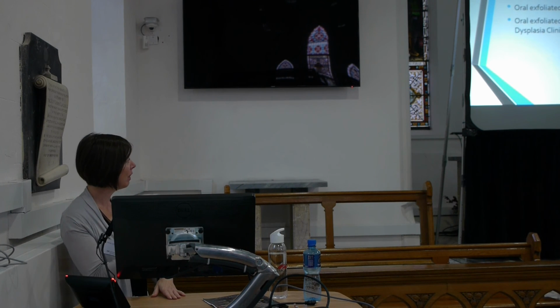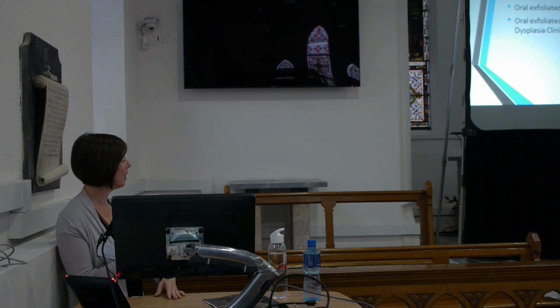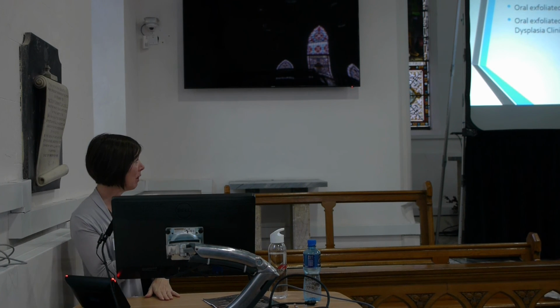volunteers, and then we've got ethical approval to go to the dysplasia clinic at the Dublin Dental Hospital, and we're going to collect samples from patients there who are showing lesions in their mouth. We're going to try and do what we did with the cervical cancer and see can we grade them, or can we predict which ones might need to be further looked at.